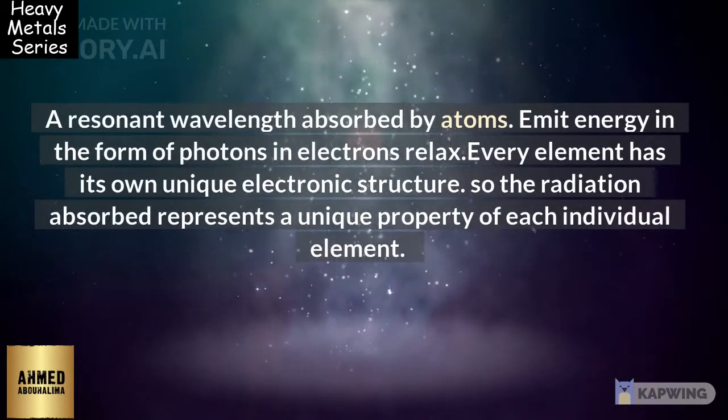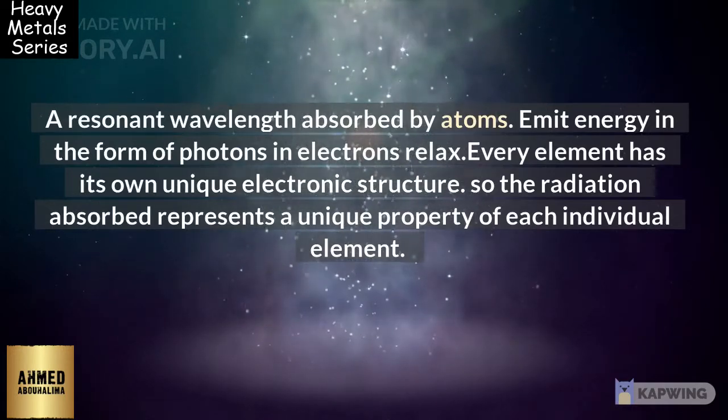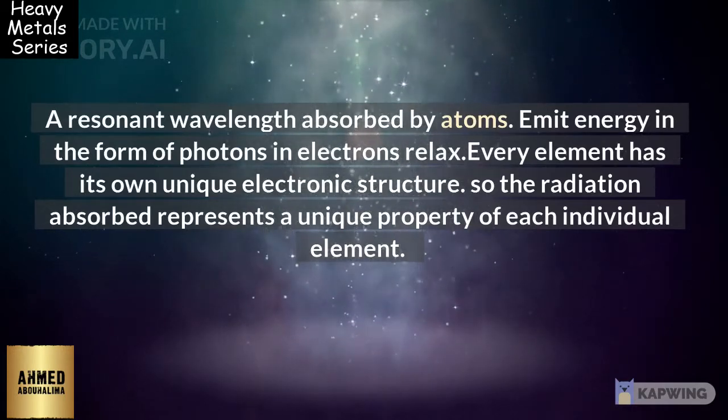Every element has its own unique electronic structure. So the radiation absorbed represents a unique property of each individual element.